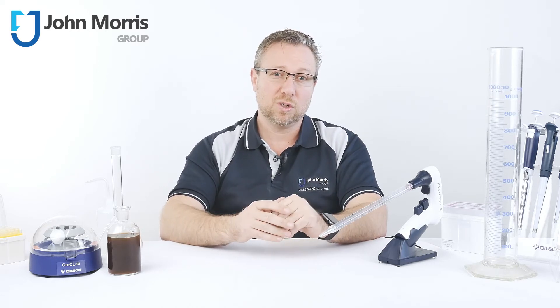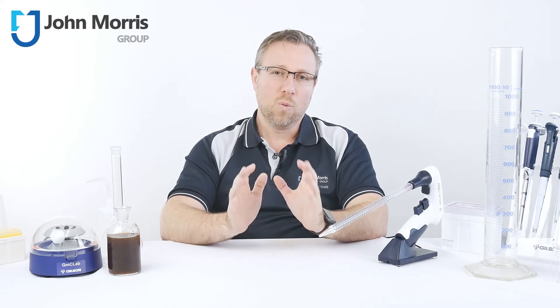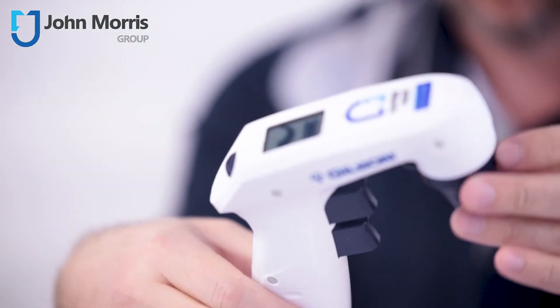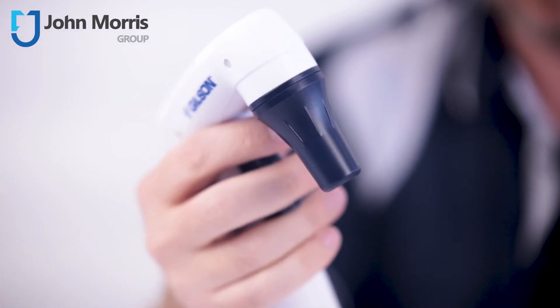Replacing the filter is also a snap, and they use a common size and design. We also love the ergonomic design — I reckon I have a smallish hand for a guy and it just sits comfortably, feels balanced, and the buttons are all in the right place.